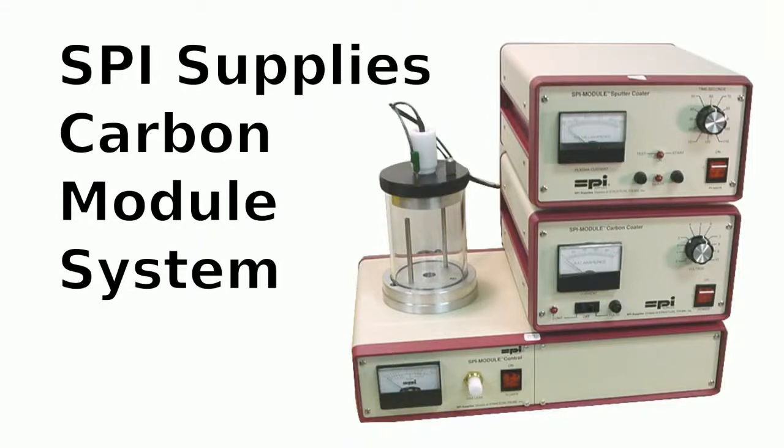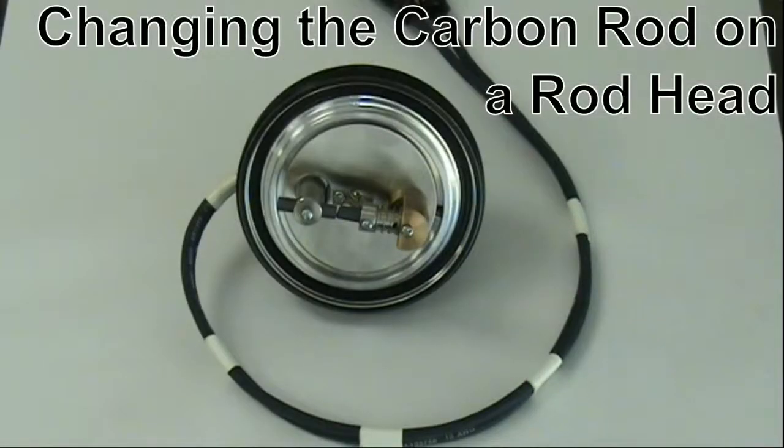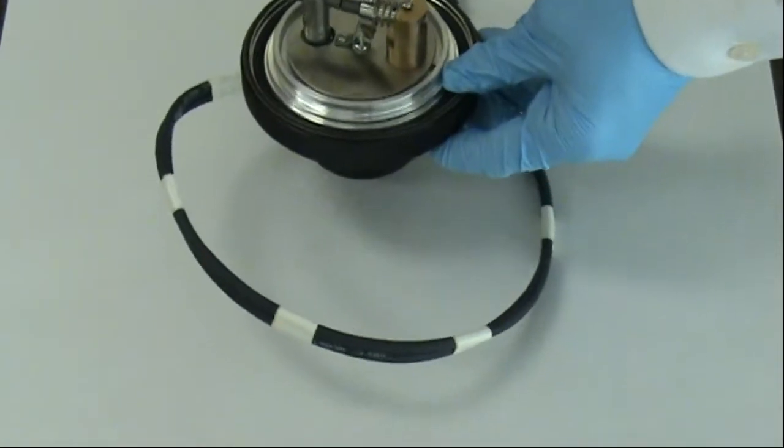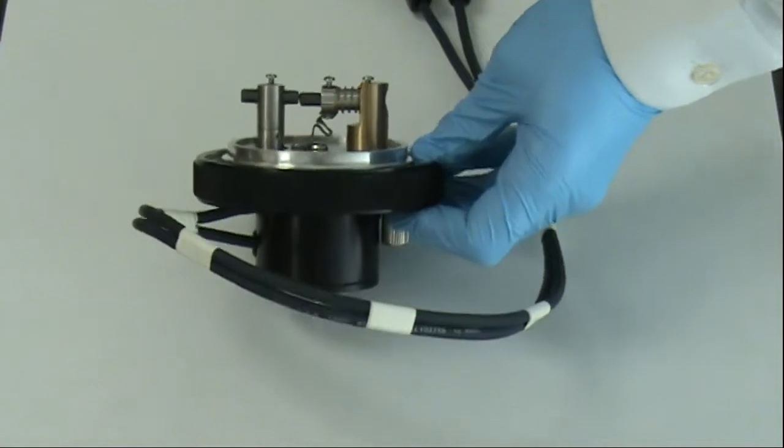Welcome to SPI Supplies Video Results. This video will show you how to change the carbon rod on an SPI Supplies rod head used on a carbon coater module.